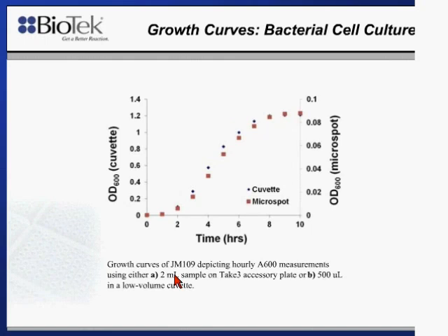You'll notice that the absorbance optical density values on the right-hand y-axis have not been path length corrected, so these are the actual values you would expect to see.